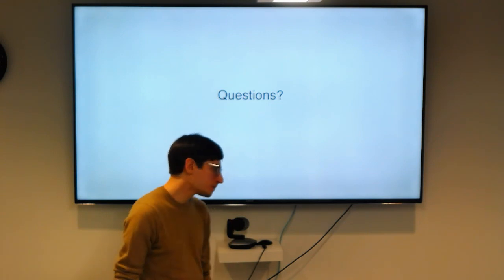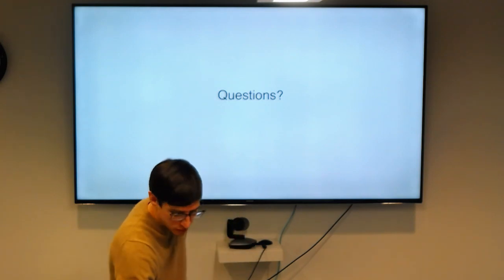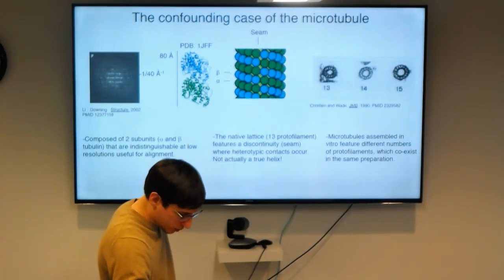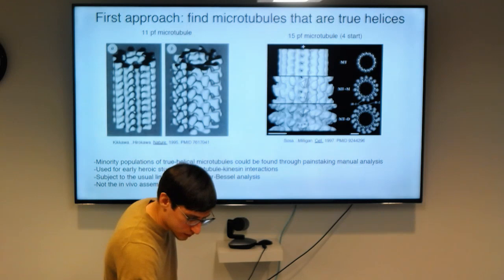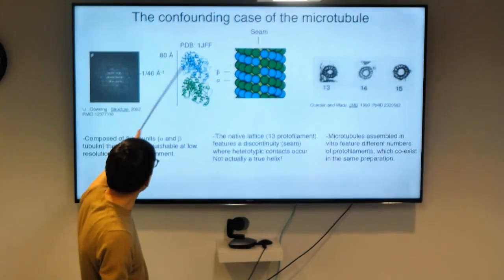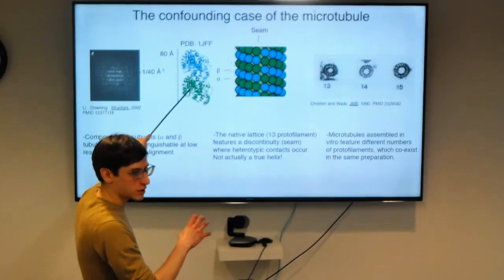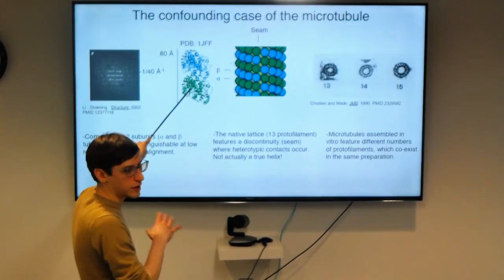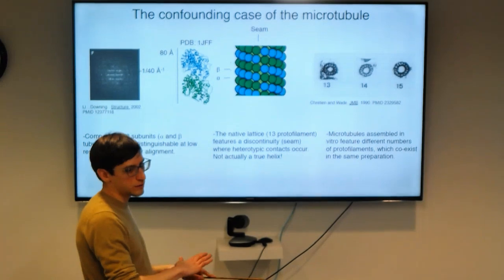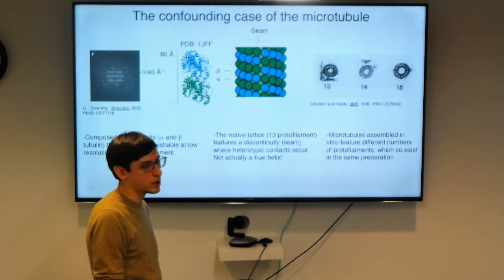No. So maybe I didn't make that clear. Usually when we're aligning, the actin is a good example, or the tubulin, right? So when you have a helix of tubulin, a microtubule, the thing that's producing this diffraction signal is a globular protein. So it's not a single secondary structural element. It's actually an object that is on the tens of nanometers scale, right? So that provides a low resolution signal that is not swamped out by the noise in your raw image, right?